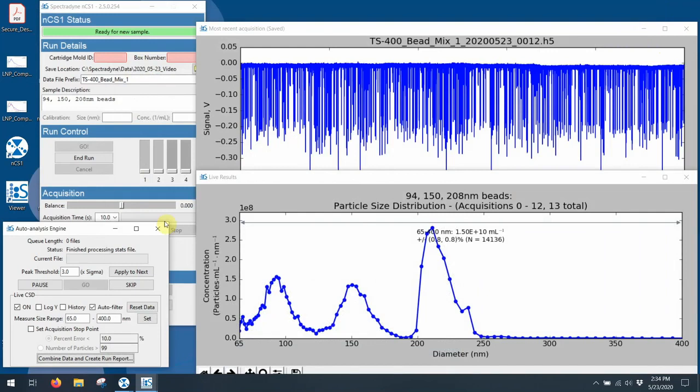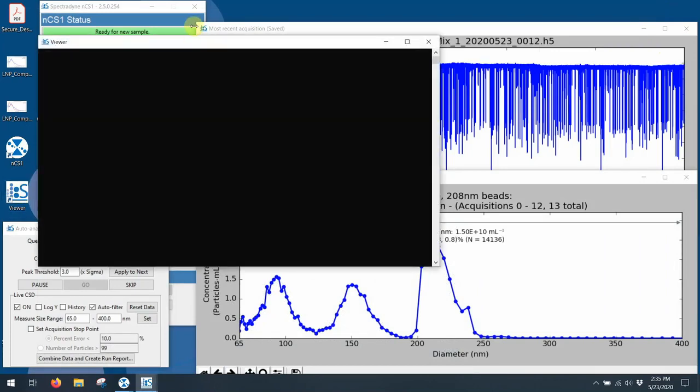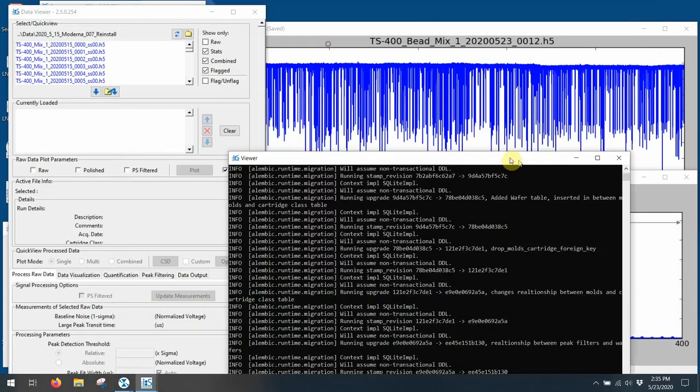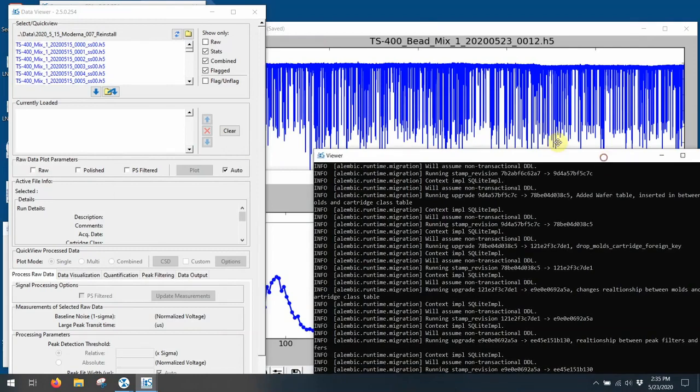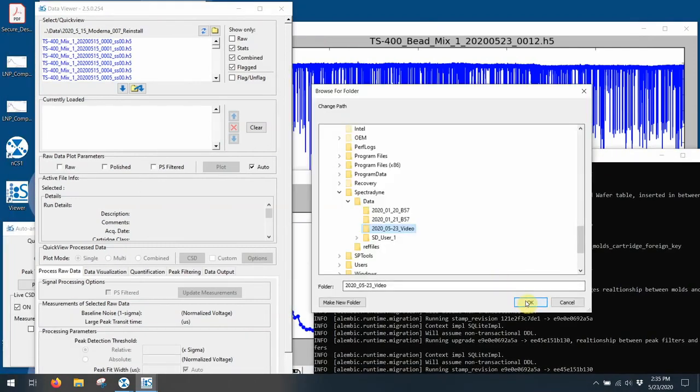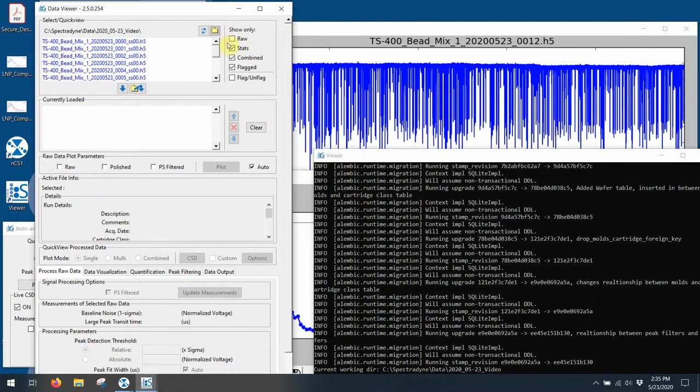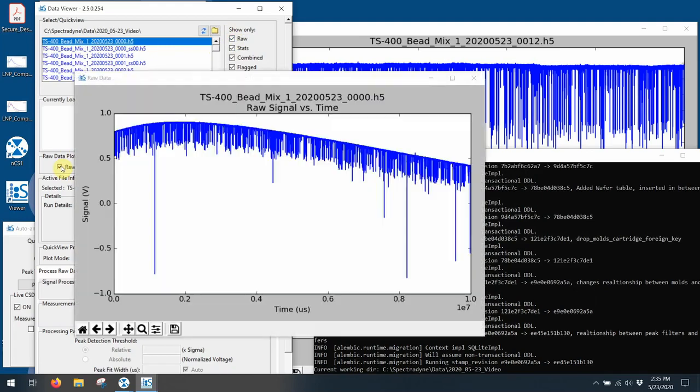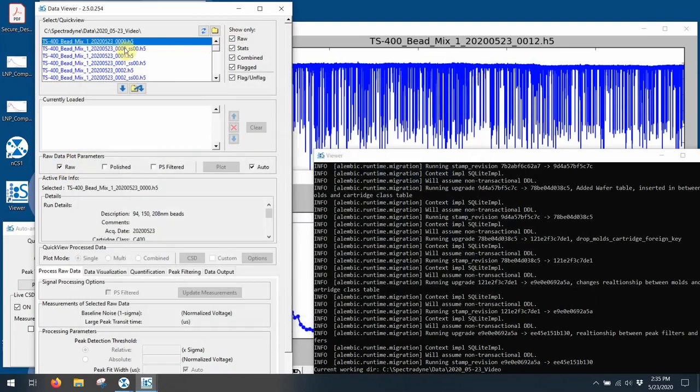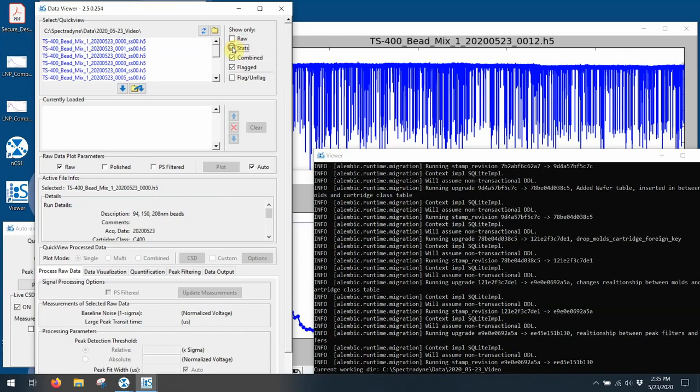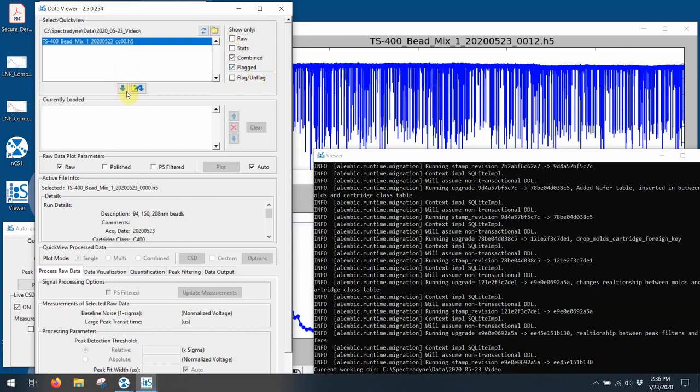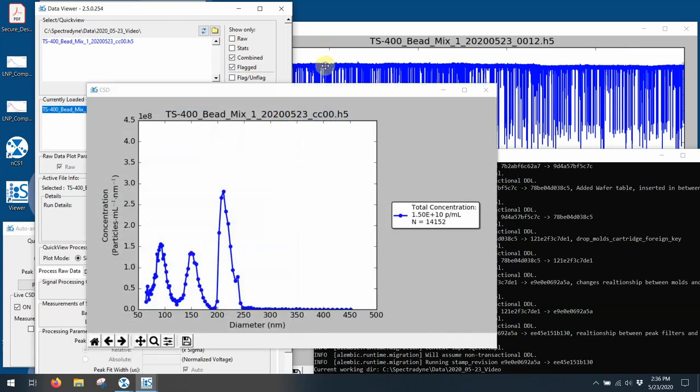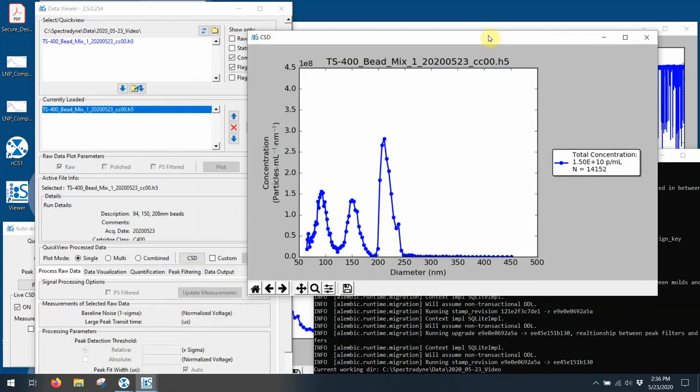I can also use the viewer software to create much more detailed reports if I need to. So let's open up the viewer real quick. And here I can see all of my files. So I've got everything that I gathered. So here's the raw file. I've got the statistics files and the combined files as well. So there's my combined file. And I can now open that up and look at it very closely.